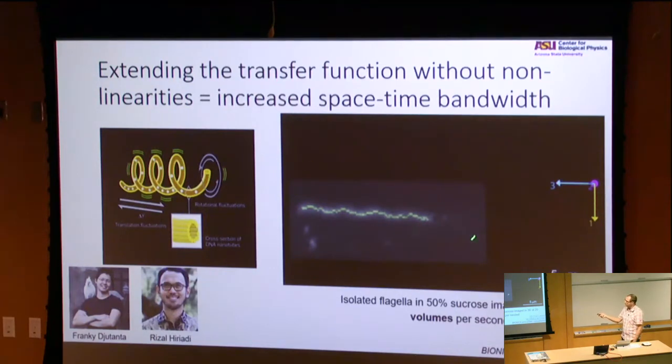These happen to be very bright structures. And what I want to point out that's really critical is this is continuous, right? This is not an experiment that extended depth of field, single molecule, point spread function engineering is going to solve, because this is a continuous object that we require to know this precession angle around. So any of these tricks that people play with trying to extend the depth of field of a microscope or change its point spread function are not going to work for this type of problem without a huge amount of computation, where we just natively image it and it works. And so we're really, really excited about this.